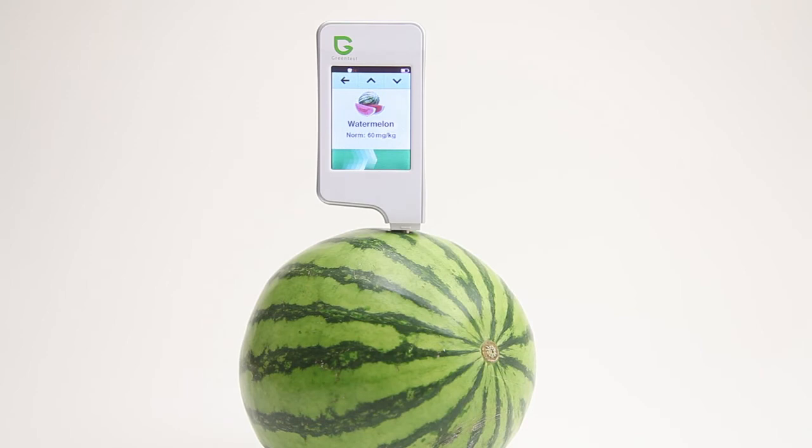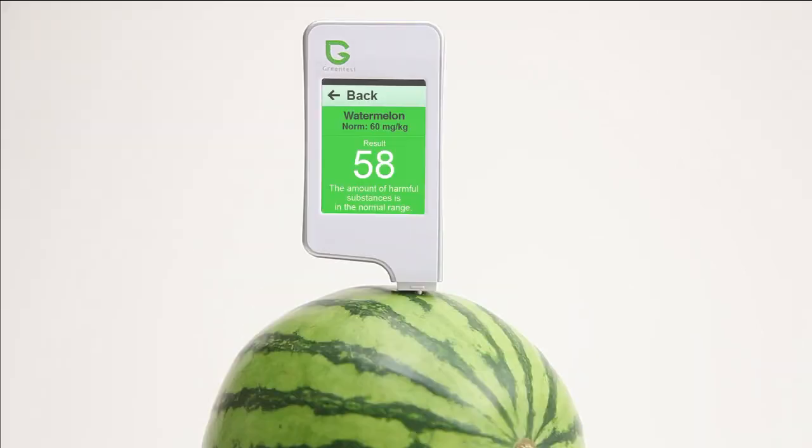Within a few seconds, the exact amount of nitrates is shown, and a color indicator allows you to quickly determine whether your fruits and vegetables are harmful or not. A normal level will appear in green, an above-normal level will appear in orange, and an extremely high level will appear in red.